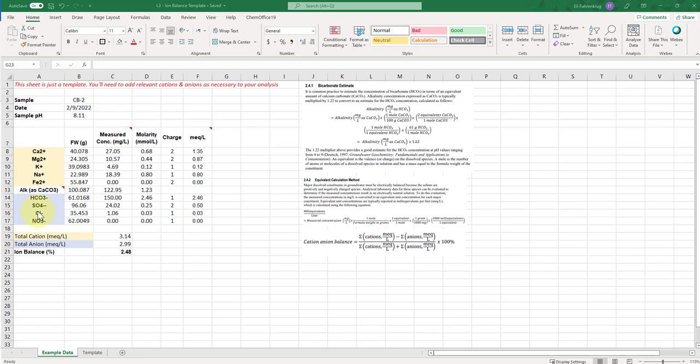And you do the same thing for the anions. There's a couple things to note about using this spreadsheet. One, it's just a template. So I've provided mock data here with mock ions.